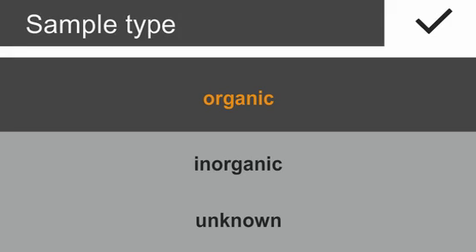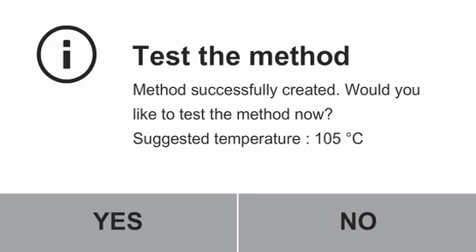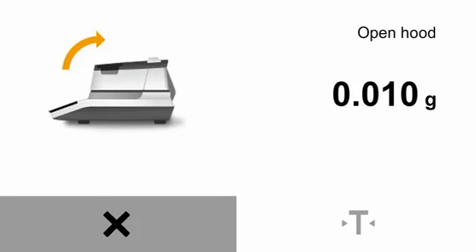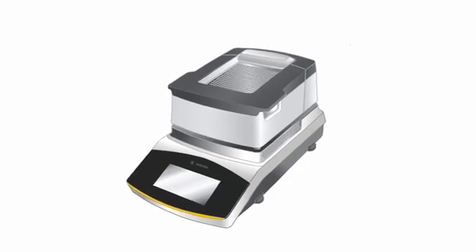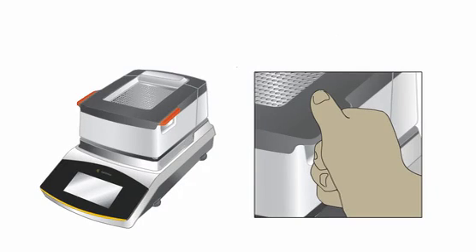Ketchup is organic. The method ketchup has now been created and can be tested. Confirm with yes and follow the instructions in the display. Starting the moisture analysis. Open the hood.